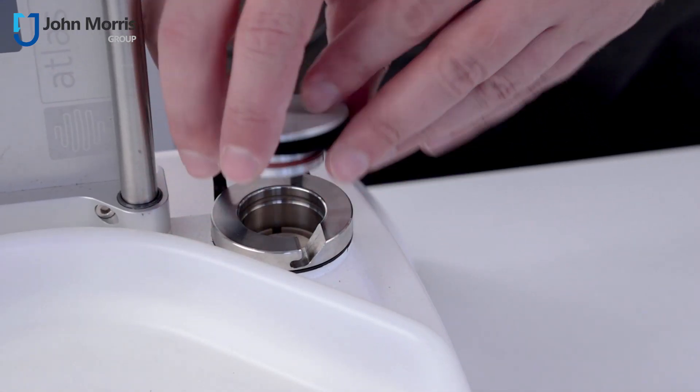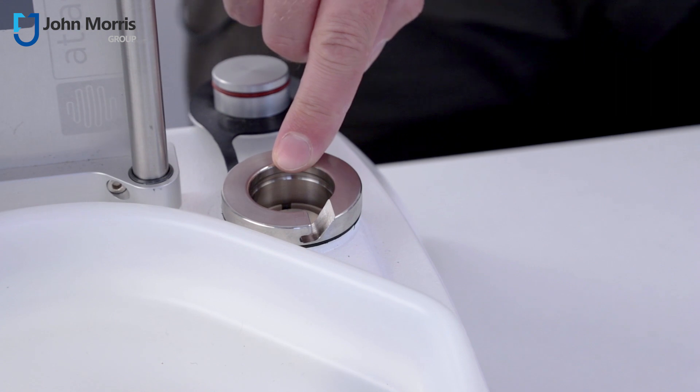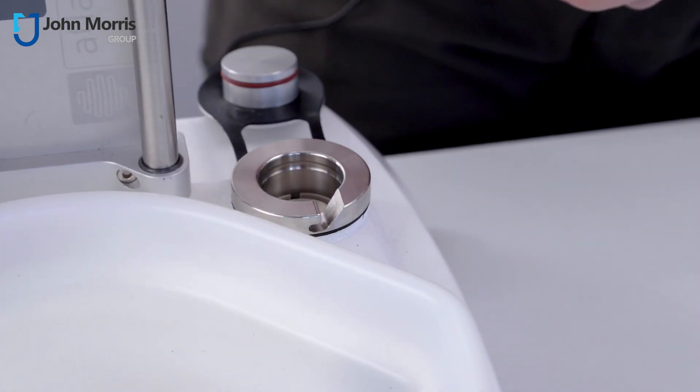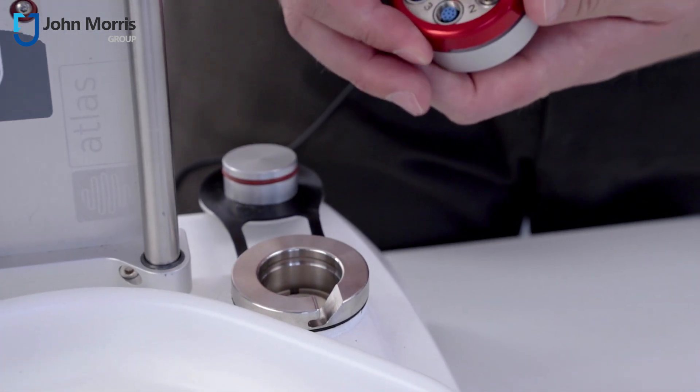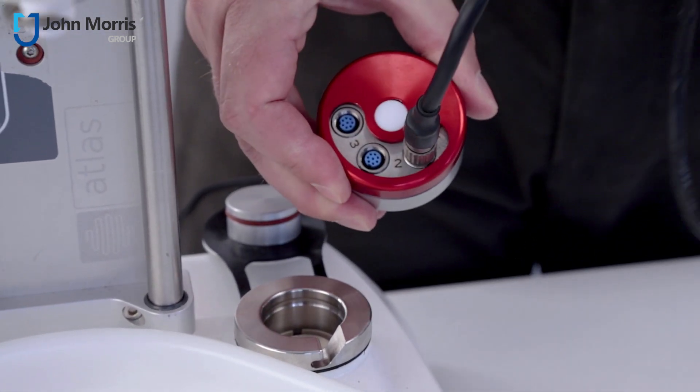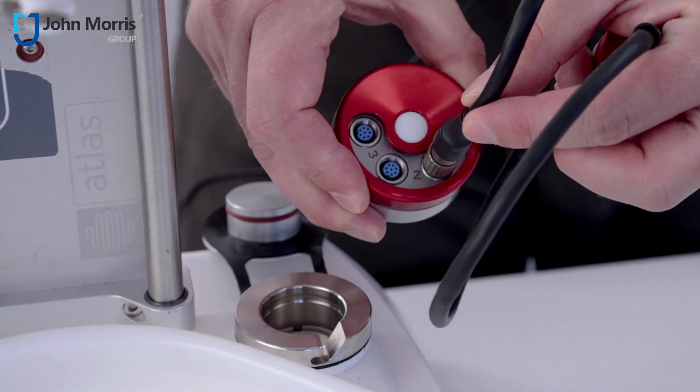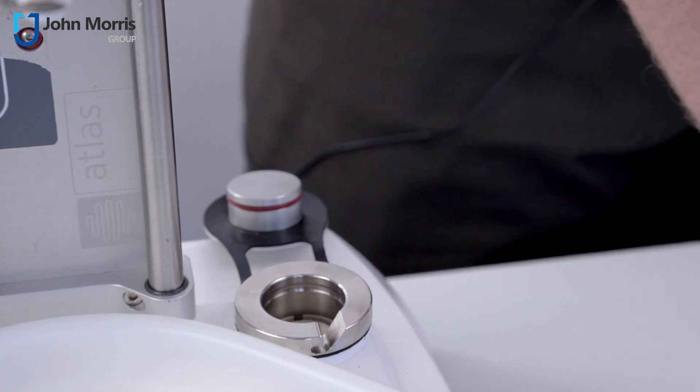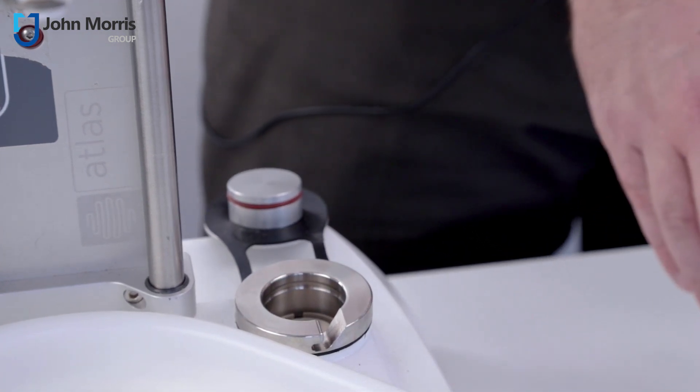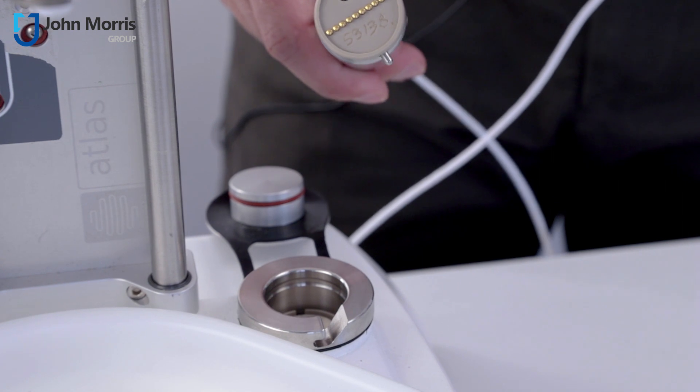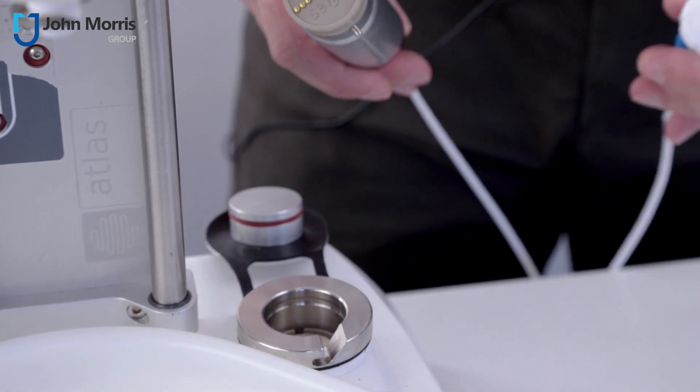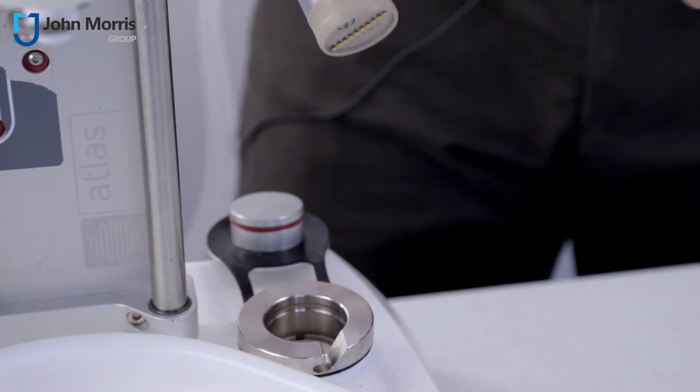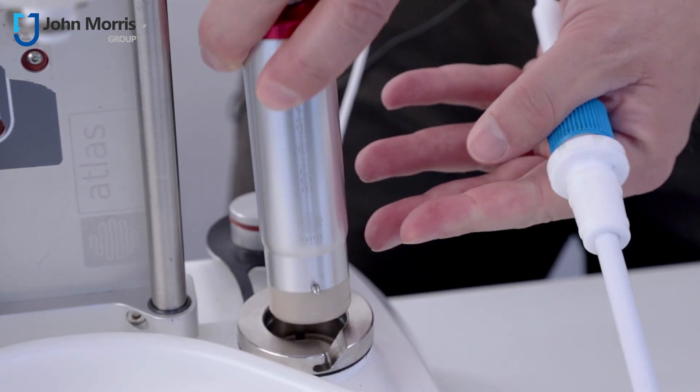What we have over here is a connection port for a bunch of different nodes and we can put an expansion device like this one here which will enable us to connect three or four, or in this case up to three different external sensors such as pH, conductivity, turbidity, etc., or we can simply slot in a single position node like this one right here, and in this case it looks like we have a temperature probe. So again it goes in until it clicks.